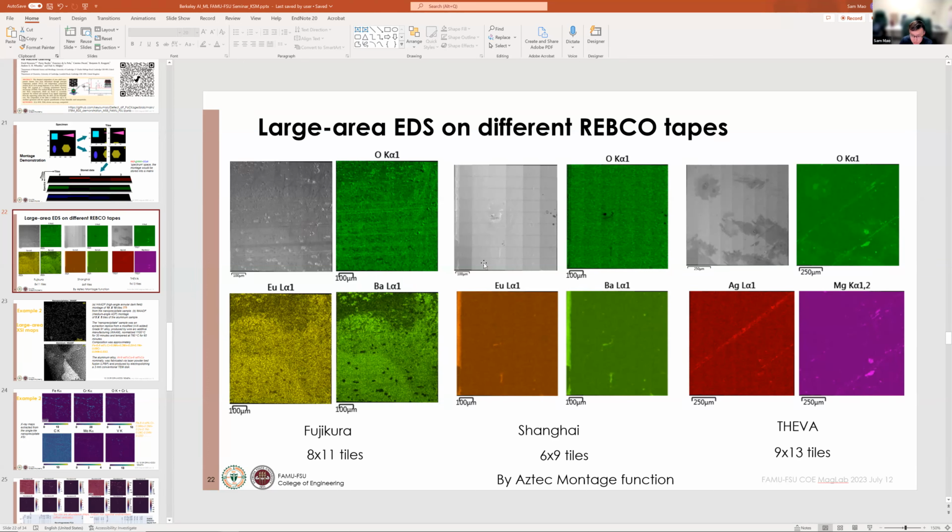But I can hop around the larger area and find a middle contrast and brightness range, so when I zoom in I won't have that issue later on. I might need a small script; I haven't tried it, I've asked people in biology to help.